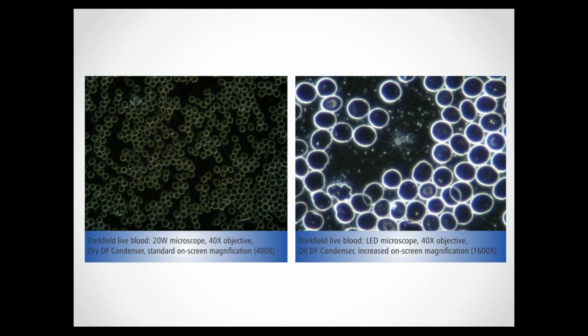I know the course is not exclusively based on dark field analysis. We have many live blood anomalies that have examples in both bright field and dark field. And of course, dry blood analysis is only done in bright field, but how important a role does dark field play in live blood analysis?